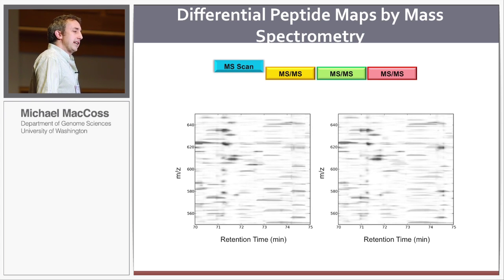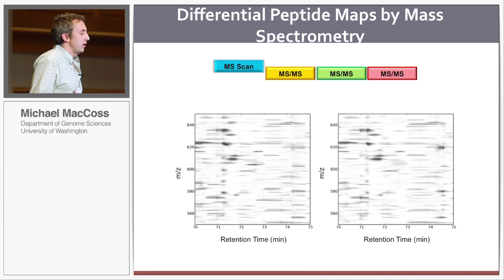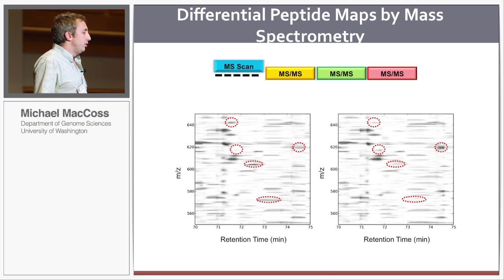So one of the things I've always wanted to do is, actually, I've never really been that interested in how big a list of peptides or proteins I can identify. What you really want to know is what the important things to track are, and you want to be able to follow them and make comparisons between samples. So you can easily do these sorts of experiments.